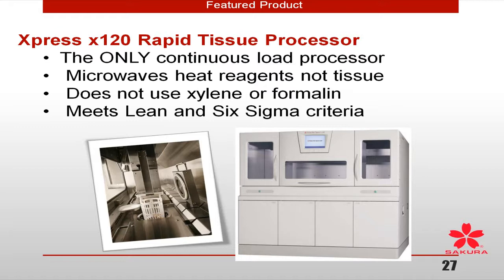So you have to figure out, if you've got a conventional processor, how to do some processing during the day in your histology program. It's okay to let it sit longer. I'm not a big proponent of letting them sit all the way out to 48 or 72. I think you're going to get different results. But you need to set up a process with whatever the tissue processor is so that when that sample is ready, I have the ability to put it onto tissue processing and get it to paraffin.